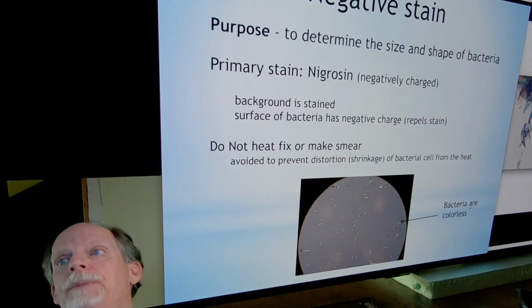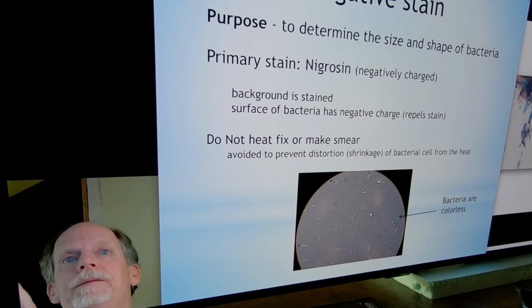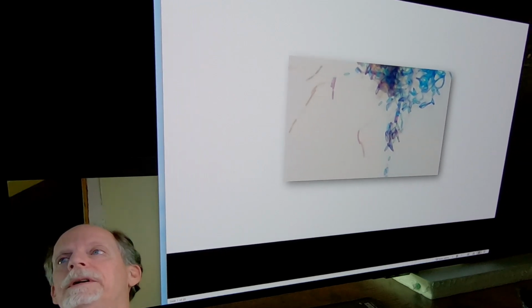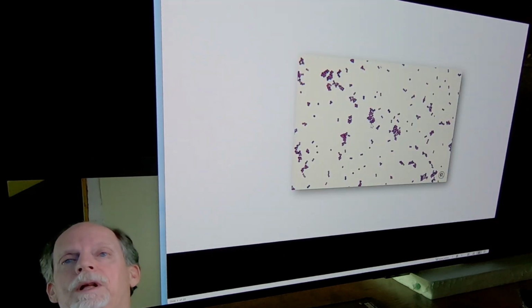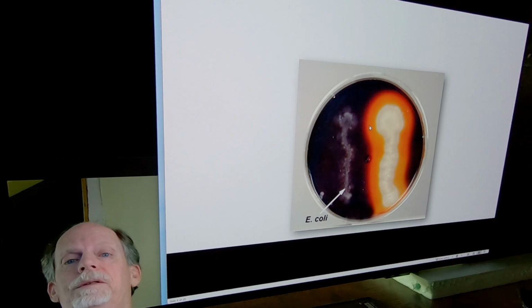When you get to each station, most of them, you'll get an image, say from the PowerPoint, like this one here. If you see this, the first question you probably get asked is, what is the name of this stain? You need to tell me. What I did with the PowerPoint figures is that this is unlabeled, so you can go through this and test yourself. What stain is this, in case this picture is used? What's the name of this test?